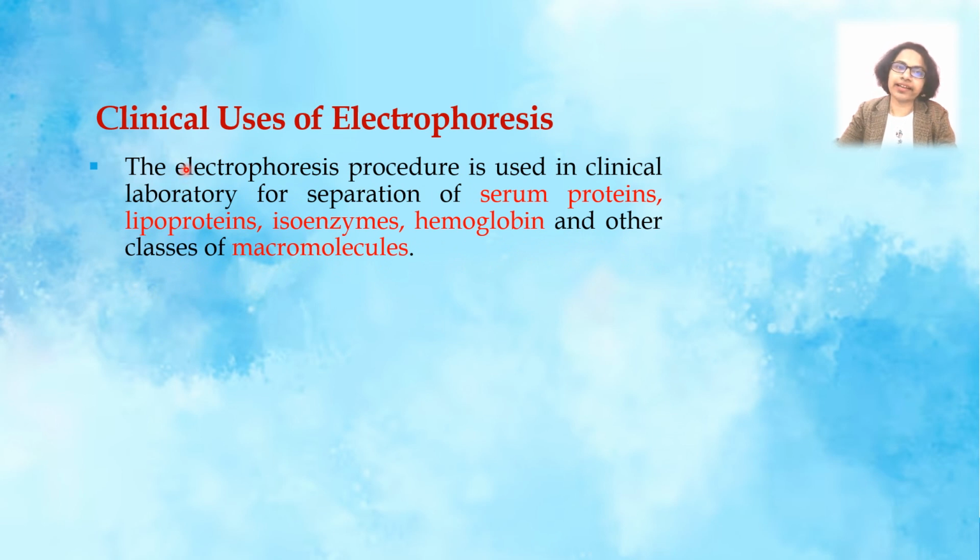Let us talk about the clinical use of electrophoresis. The electrophoresis procedure is used in the clinical laboratory for separation of serum proteins, lipoproteins, isoenzymes, hemoglobin, and other classes of macromolecules.